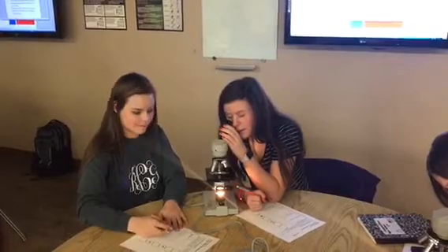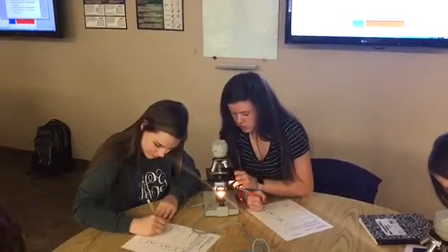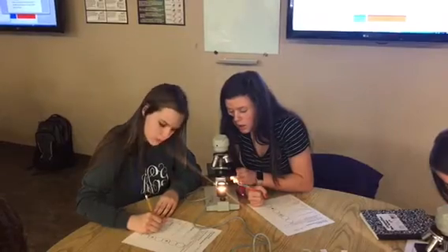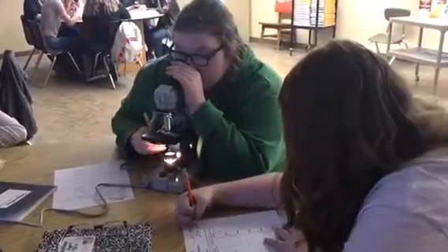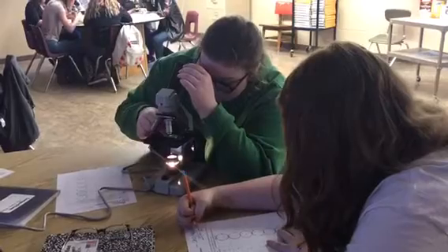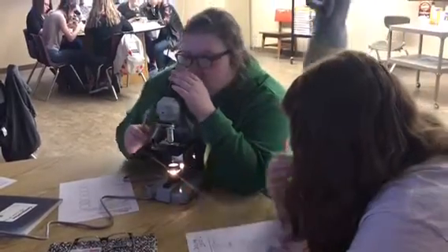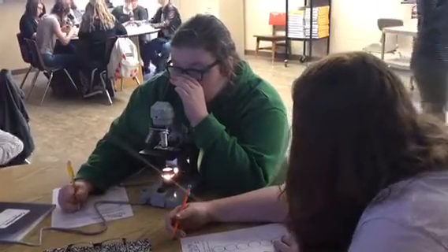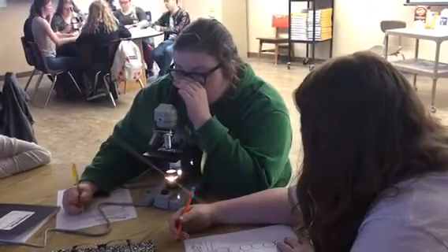You don't have to close one eye when you use the lens. Make sure once you're finished, you're trading off with other people at your table. And when one table that has slide number 5 is finished, raise your hand, and I'll take it to tables 4 and 5.